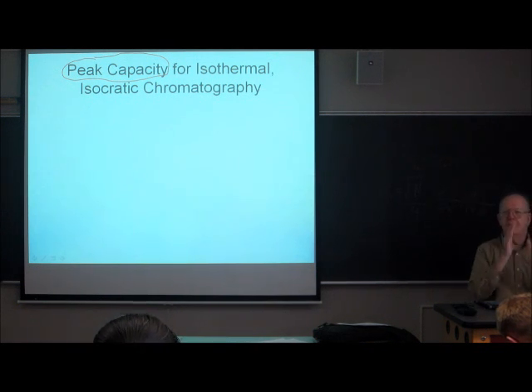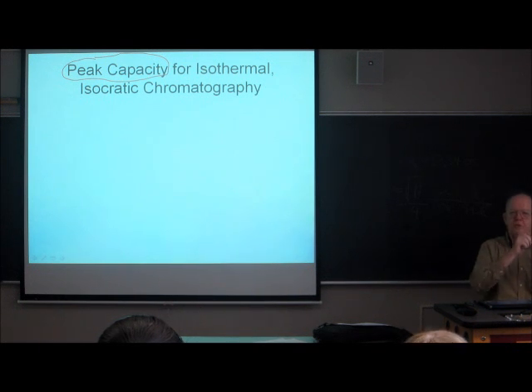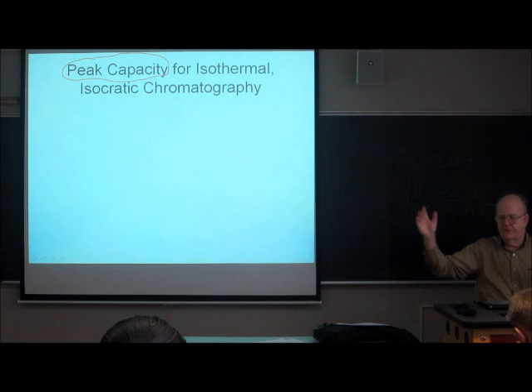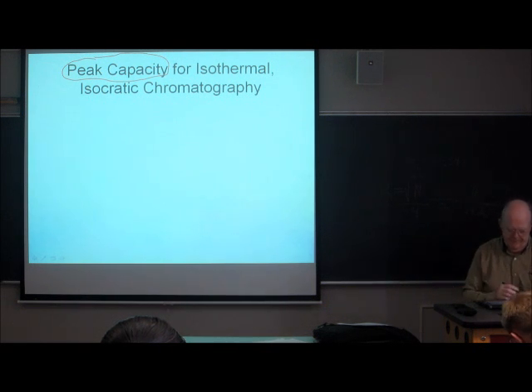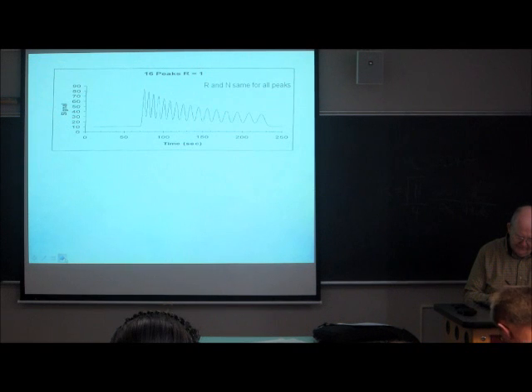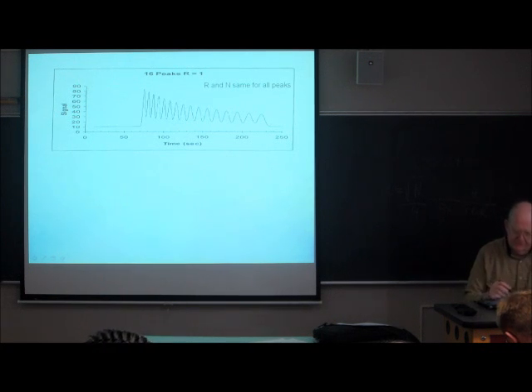That means that the peaks all have the same resolution. So peaks 2 and 1 are as well separated as peaks 3 and 2, 4 and 3, 5 and 4, and all the way out to the last peak that fits in the window. It turns out that the math of adding those up is really not difficult, and we'll get there in a second. But this is what I'm talking about now.